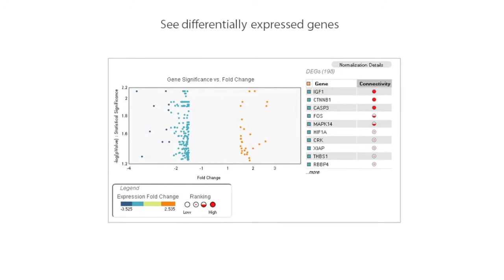You can sort your differentially expressed genes by fold change and see how connected they are to other genes in the experiment. You can easily visualize the significance, fold change, and interconnectivity of these genes.